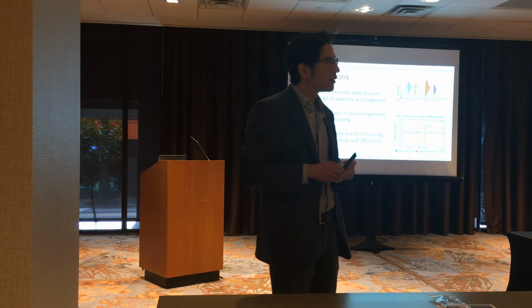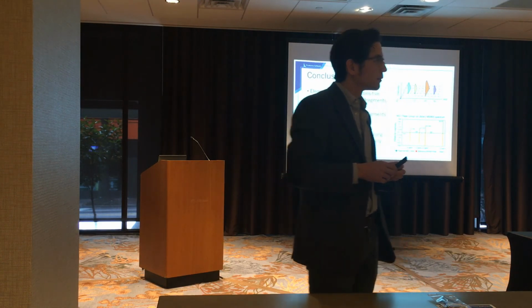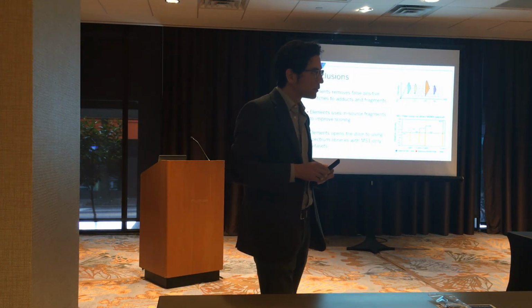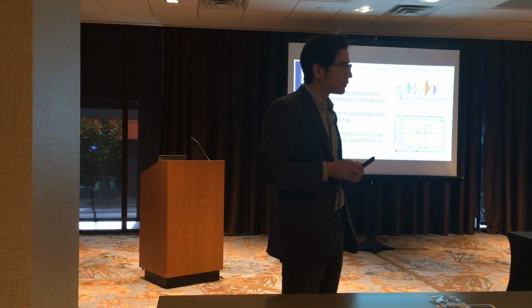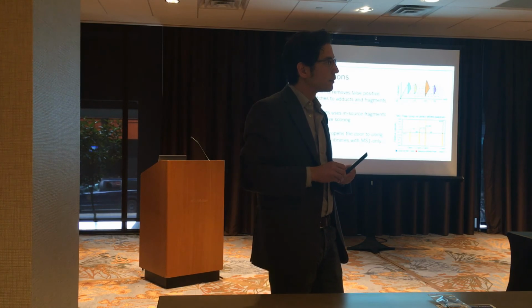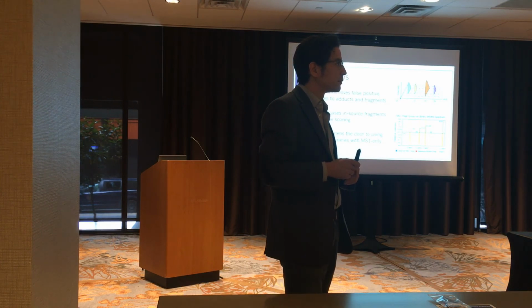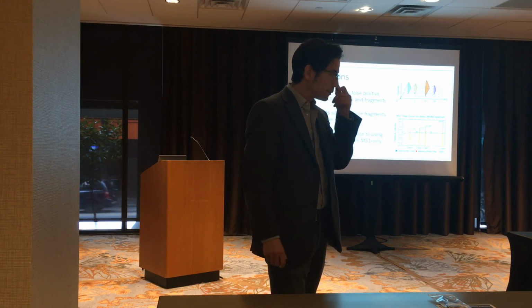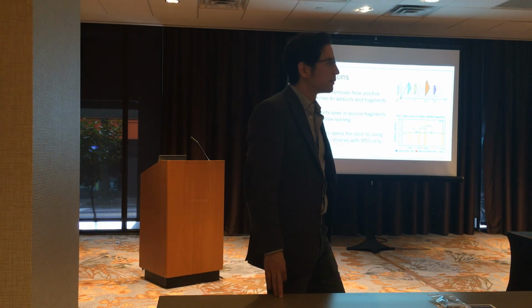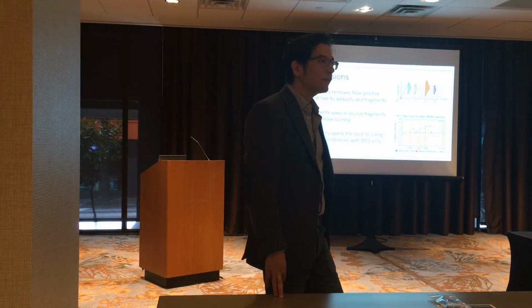Well, see, there's a problem with metabolomics, because I've also used that and run in my lab, having done small molecules first. And in proteomics, we're very lazy, easy. You can use 30% collision energy, 35, 32, whatever. But here, the small molecules have a very specific range. And sometimes if you use a step collision energy, that will help. But you may not have the ideal settings, and you may have too much energy for your molecule in your actual collision. And so you're getting a much more gentle fragmentation in the source. And it is complementary information, not overlapping. I mean, not identical. Yeah.